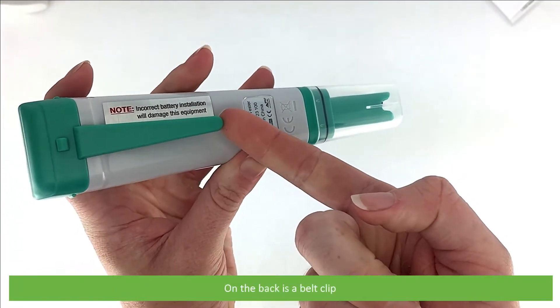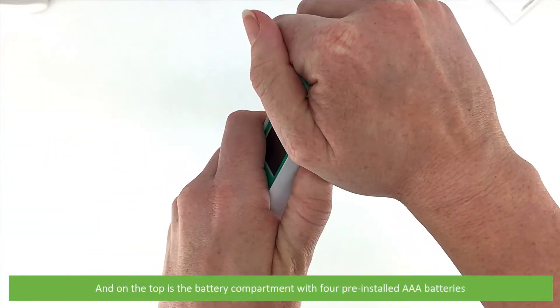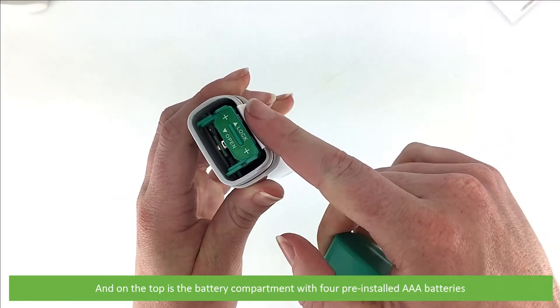On the back is a belt clip, and on the top is a battery compartment with four pre-installed AAA batteries.